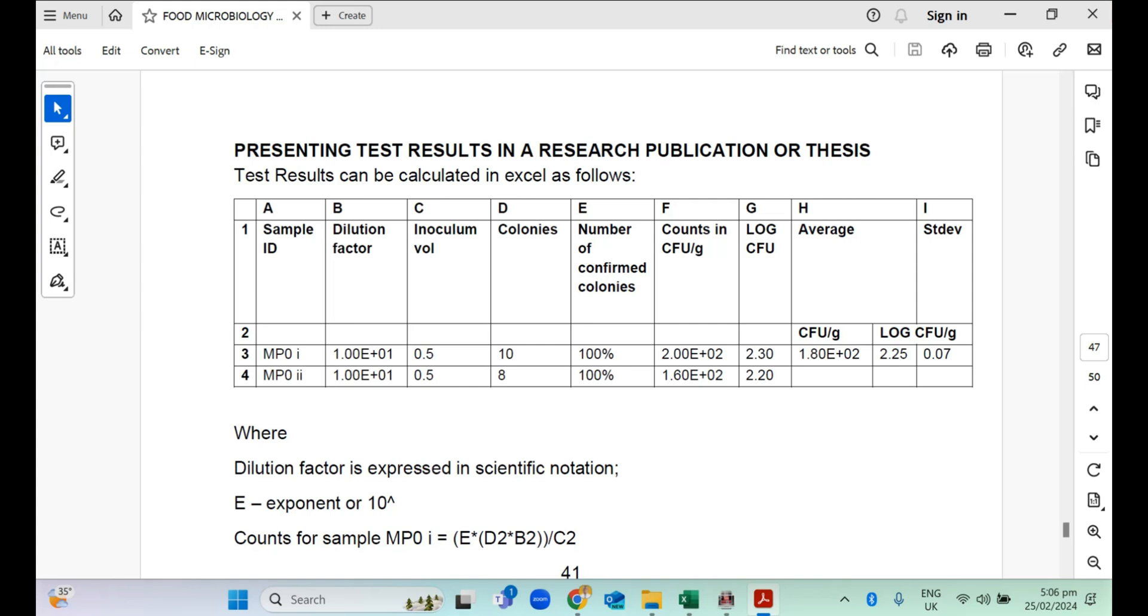The dilution factor, the inoculum volume and the colonies. The colonies is the number of colonies growing on the plate after incubation, the number of cell mass that comes together as a colony for growth. That is the colonies or colony counts.